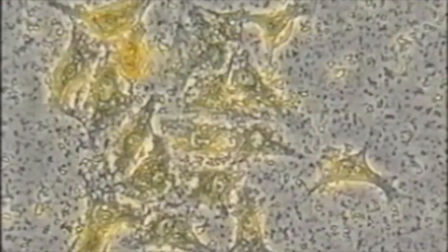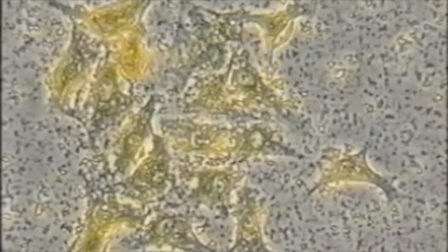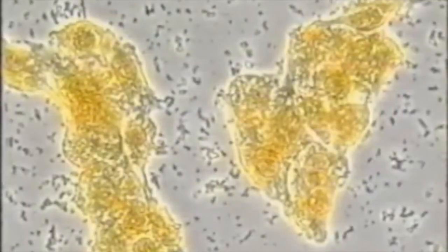Following 24 hours in the presence of PB100, cancer cells have been destroyed. Their cytoplasmic membrane has disappeared, and cytoplasm has disintegrated. Under visible light, nuclei and nucleoli are orange. The nuclear membrane is torn in places. Under UV light, the blue fluorescence of PB100 has clearly decreased, but it remains concentrated in the nuclei. As this experiment demonstrates, PB100 selectively destroyed cancer cells without affecting normal cells.